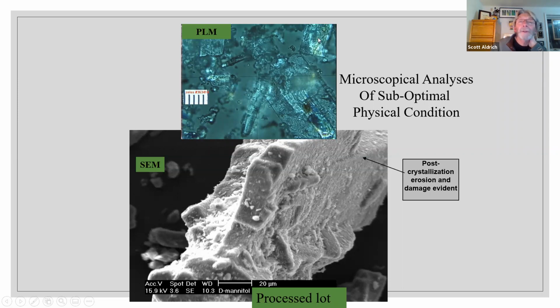And so what's happened here is this drug, through heat and pressure, has changed state somewhat, and some parts of it are more amorphous and other parts of it are crystalline. And that may affect its solubility, its stability, the way it processes. And it's just another feature to look for. So you see, when the pharmaceutical companies complain about charging a lot for drugs, some of it is to pay for investigations like this. Maybe not much of it, but some of it.